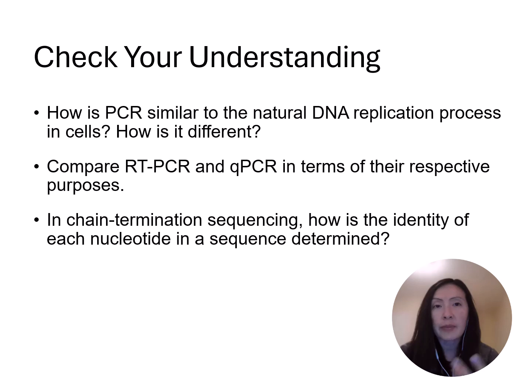The difference is that PCR occurs in a machine, that thermocycler, that cycles through high temperature steps: denaturation, annealing, and extension. It uses that heat-stable Taq DNA polymerase from Thermus aquaticus bacterium, instead of cell enzymes. So PCR also only amplifies a specific DNA region in vitro, right, outside of the body, not the entire genome inside the cell.